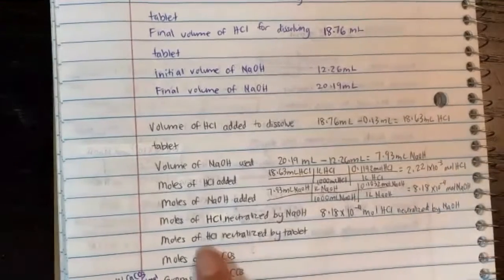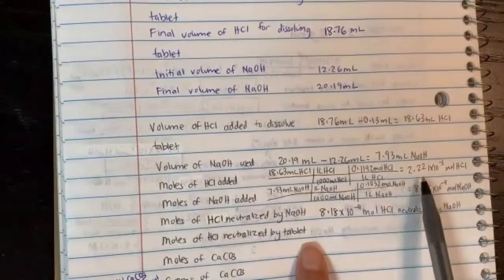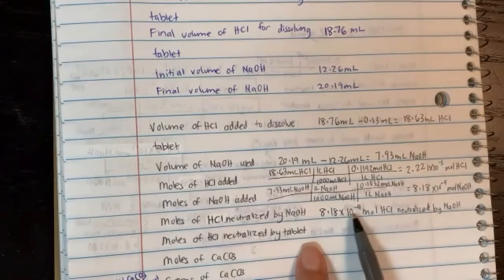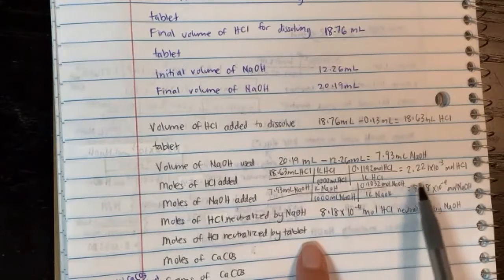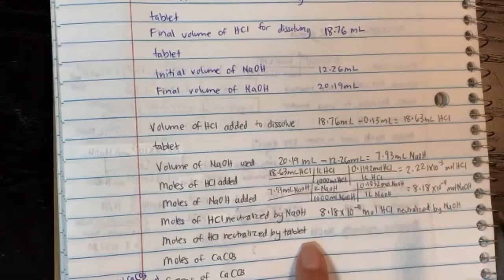So the leftover HCl was neutralized by the tablet. So how much is the leftover? Well, we know the total is 2.221 times 10 to the minus 3, and we used up 8.18 times 10 to the minus 4 to neutralize with sodium hydroxide, which is one of the bases. So the second base will be this value of HCl minus this value of HCl. So let me write it down.